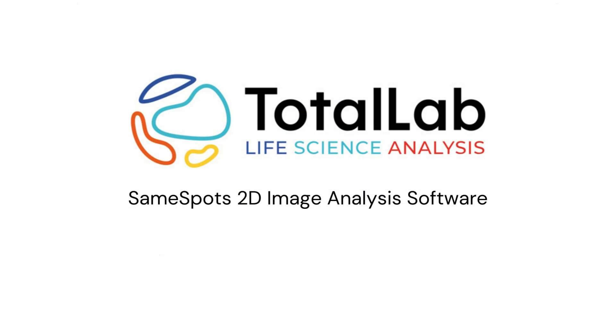That was a quick run-through of how SameSpots can help to improve the quality level of the analysis coming out of your lab, and reduce operator error by making sure that only the best quality images are being used for analysis. If you'd like to try a free demo of SameSpots for 14 days to see how SameSpots can help improve the quality within your lab, please check out the links in the video description below.